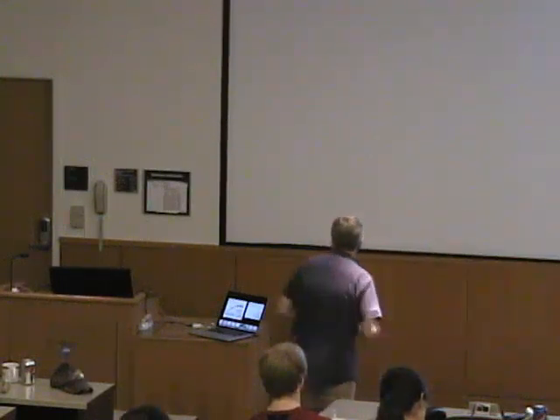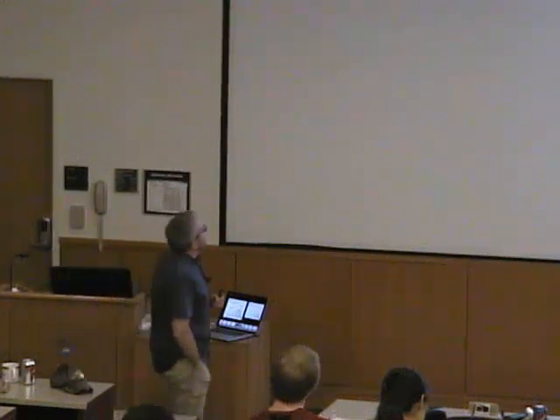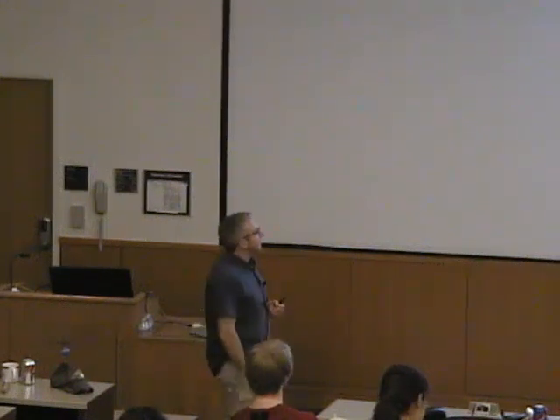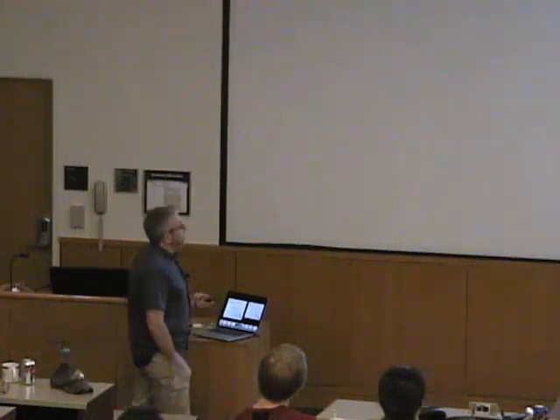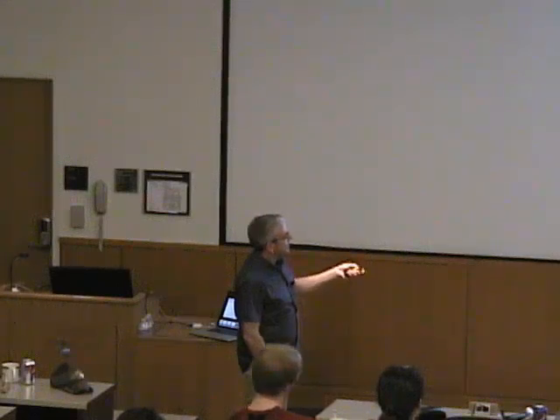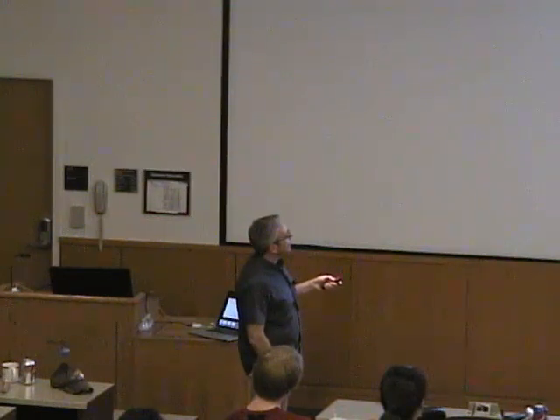Okay? But then, if you go on, and that was done by 2 gentlemen in the UK, William Bragg and William Bragg, father and son. And they thought, okay, now let's see what happens if we imagine that on such a set of lattice planes we get a reflection of our X-ray beam. Okay? Let's zoom in. So these lattice planes have a characteristic distance of D, and this is now reflection, which means the incident angle is the same as the outgoing angle. It's an angle theta, and of course we're coming in with a parallel wavefront.